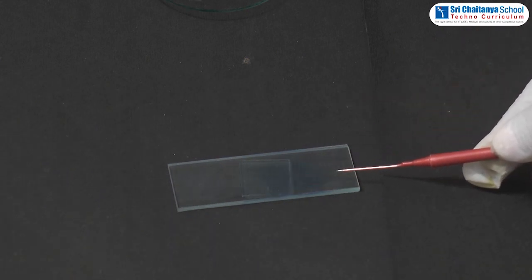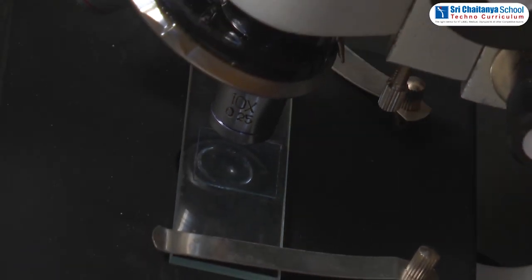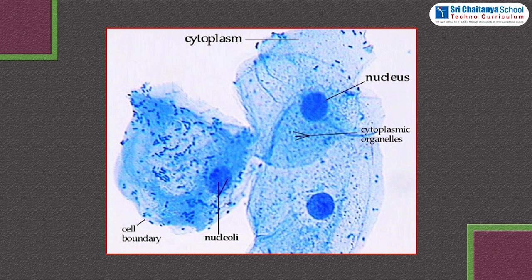Place this glass slide on the stage of the compound microscope and view it. A large number of flat and irregular shaped cells are observed. Conclusion: the cells do not have a cell wall but have a thin cell membrane. A deeply stained nucleus is observed at the center of the cell. No prominent vacuole is observed. The cells are confirmed as animal cells.